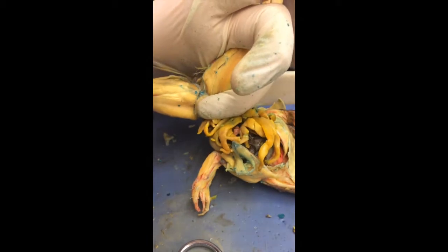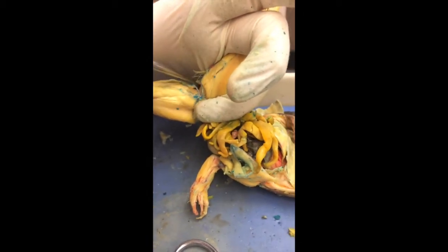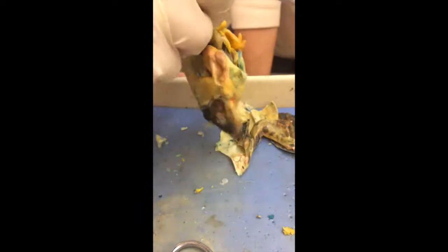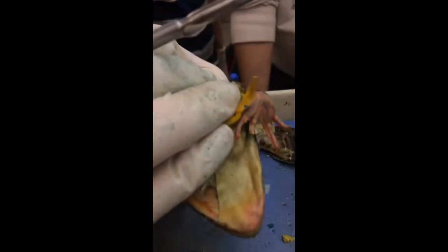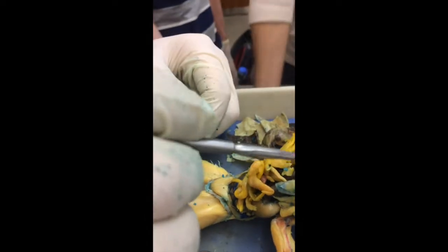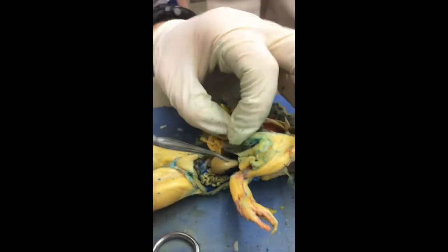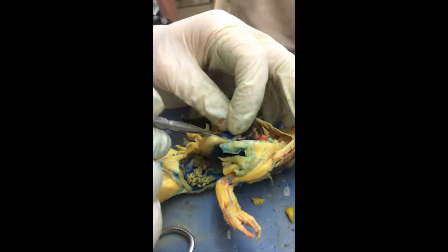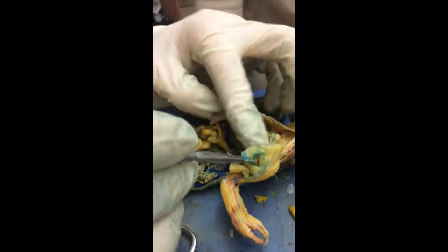Let's see if we can find it. Cloaca is where we get everything coming out of, essentially. I don't see it here. We're gonna move on from that for the moment. Let's see what else. I want to show you guys the spleen. I don't know why we got injected ones. These are not as clear.